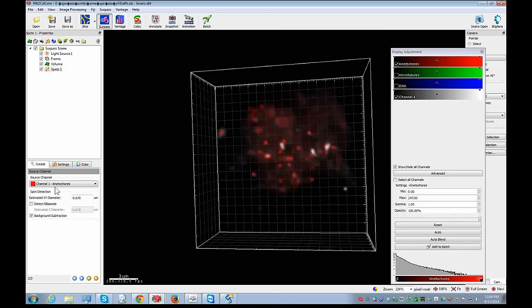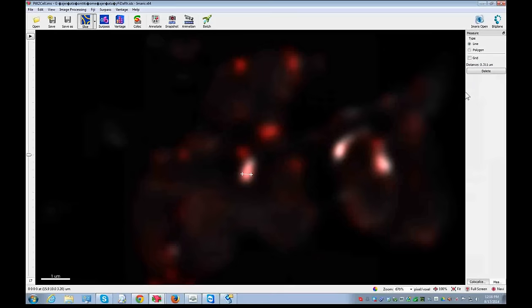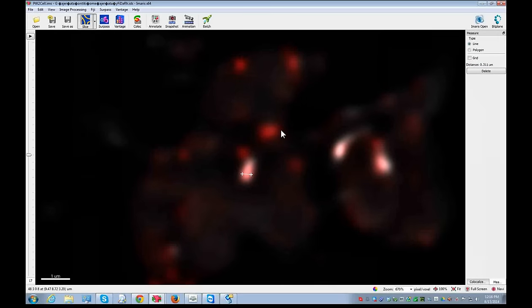Just interrupt you briefly, Arvonn. Sure. So each person had a different question. One wants distance in the same channel, and the other wants different channels. If you could quickly show both options.